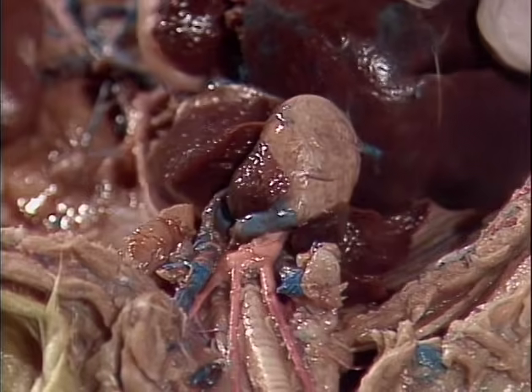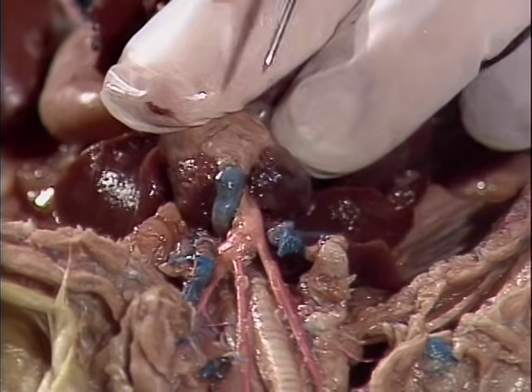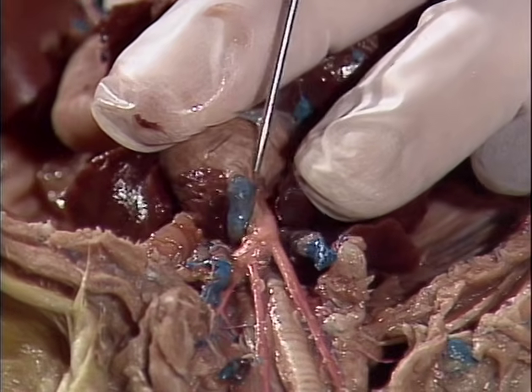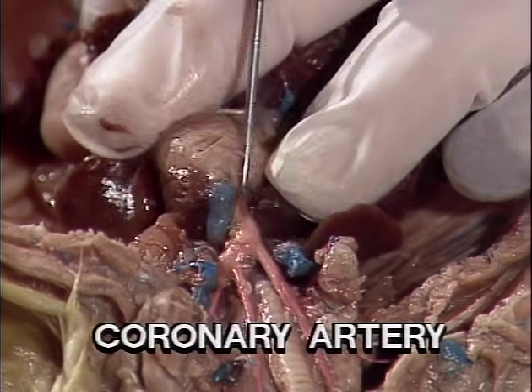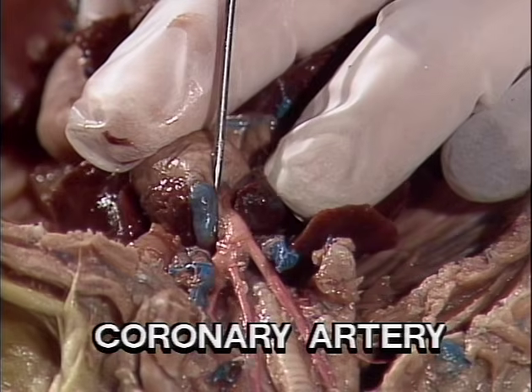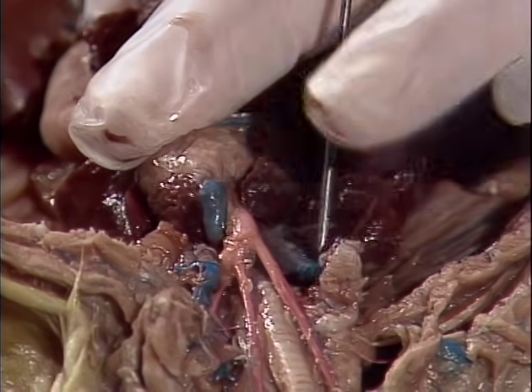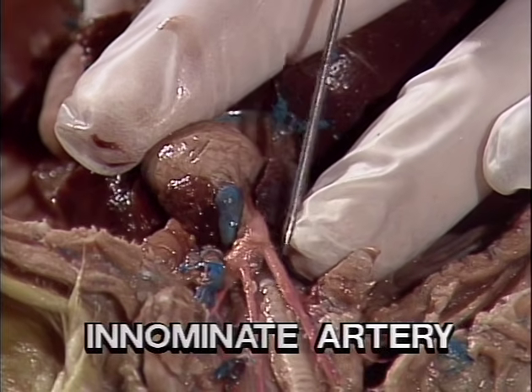The aortic arch gives off 5 branches. The first 2 branches are immediate and are difficult to see, especially from this view. They are known as the coronary arteries and supply the heart muscle itself with blood. The next branch is known as the innominate artery.